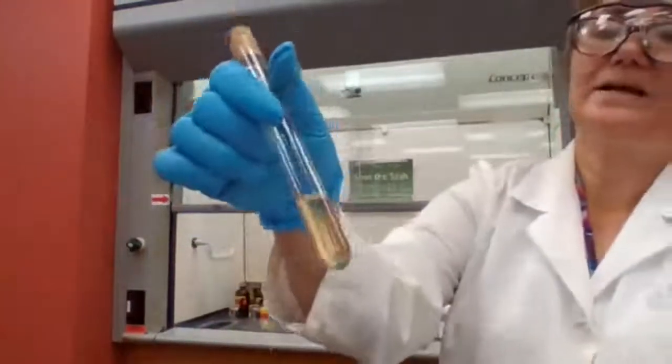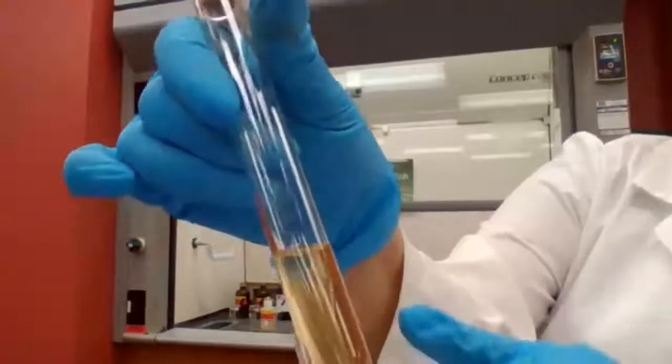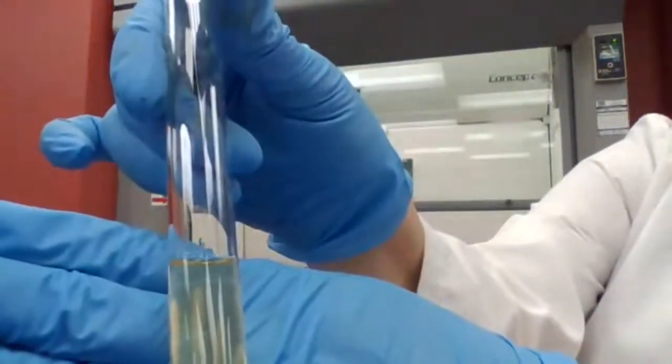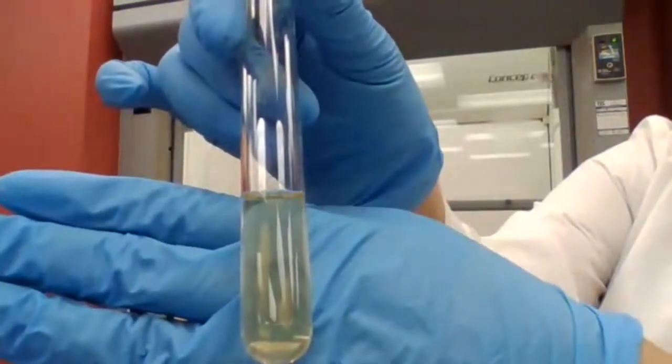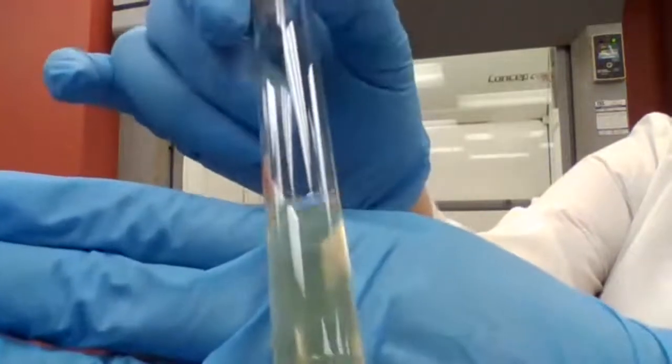It's turning slightly cloudy from the precipitate. I see some particles. I'm not sure how clear it is for you. Can you see any particles? I have some white particles floating.